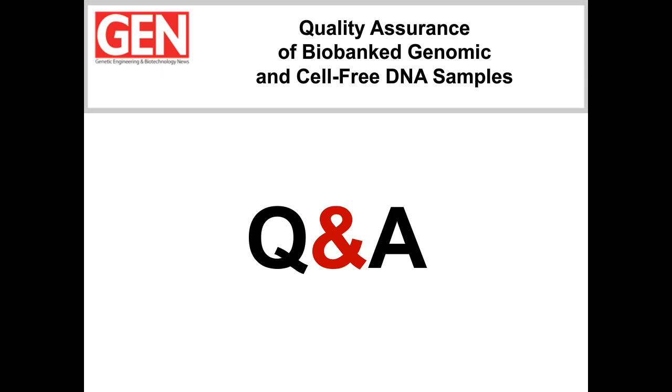Our first question is for Rainer. Rainer, one of our audience members would like to know if the TapeStation can be used for bacterial DNA or a mixed DNA-RNA sample. Yes, thanks for this interesting question. Yes, of course, TapeStation can be used to analyze isolated genomic bacterial DNA. In fact, we also have an application note that shows some examples with different organisms and also shows quite a variety of different DNA integrity numbers there. So simply check on our website. There's an application note out there.